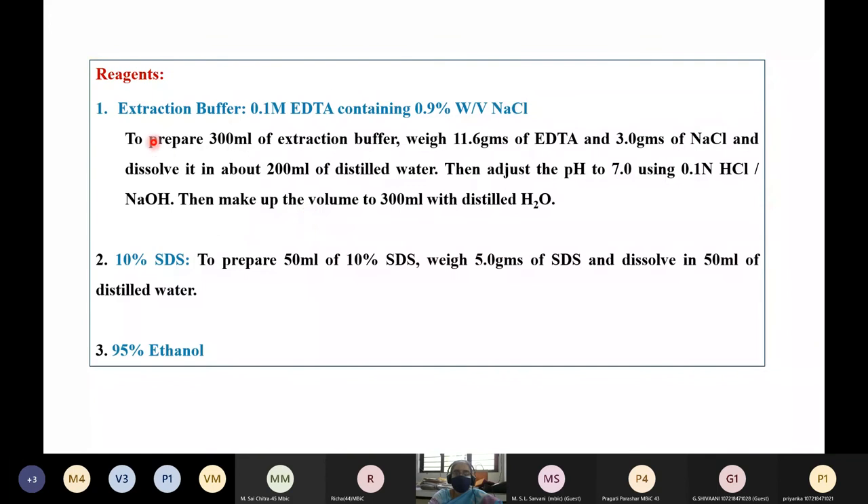The reagents required: first is the extraction buffer, which is prepared with 0.1 molar EDTA containing 0.9% weight by volume of NaCl. To prepare the buffer, weigh 11.6 grams of EDTA and 3 grams of sodium chloride and dissolve in about 200 ml of distilled water. Then adjust the pH to 7 using 0.1 normal HCl or 0.1 normal sodium hydroxide, and make up the final volume to 300 ml with distilled water.